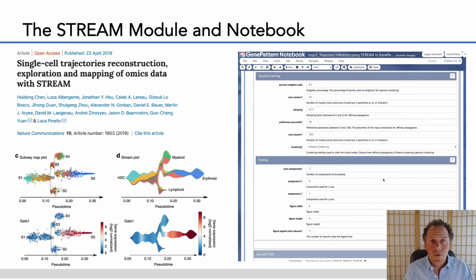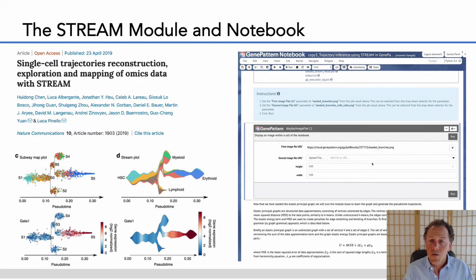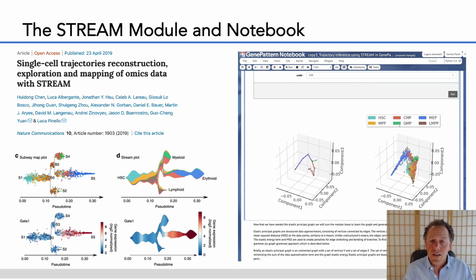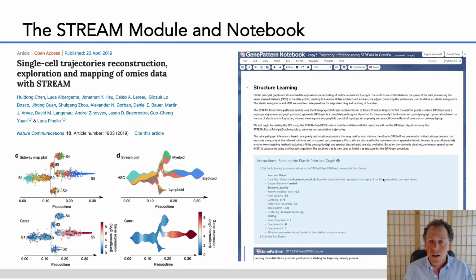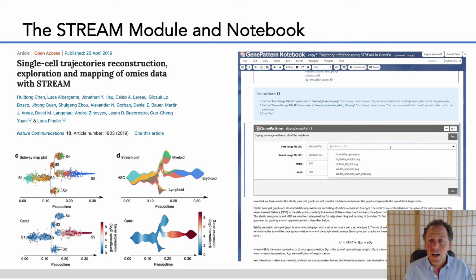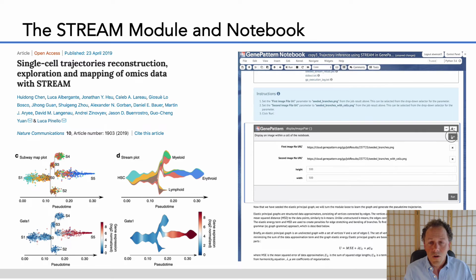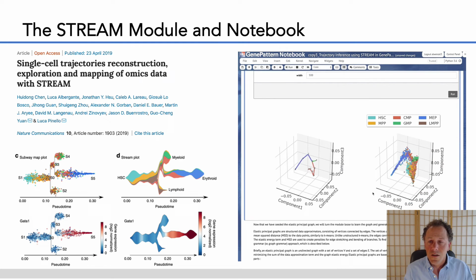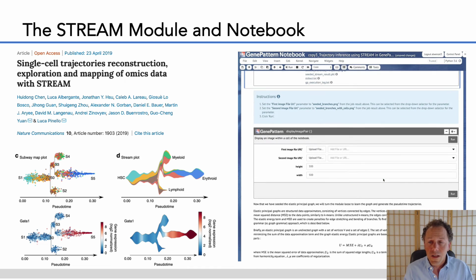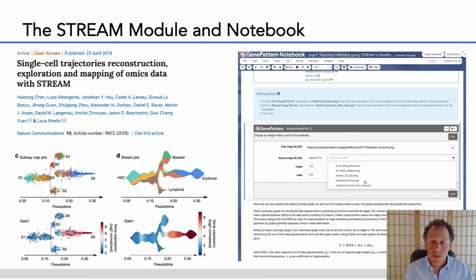We have also implemented a pseudotime method called Stream from the lab of Luca Pinello using GenePattern modules and notebooks. Pseudotime analyses use techniques such as dimensionality reduction and applications of graph theory to identify these processes in the data and order the cells along a pseudotime trajectory. As a note, in this ordering, the distance between one cell and another does not indicate a difference in terms of real units of time. It only indicates which cell comes after another in the sequence of a specific biological process.